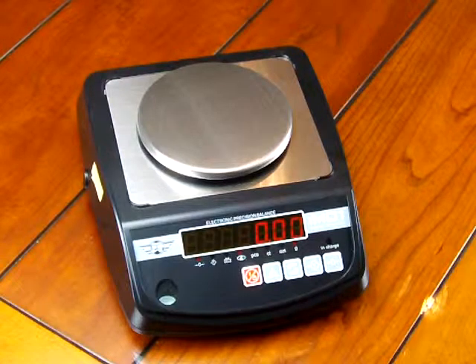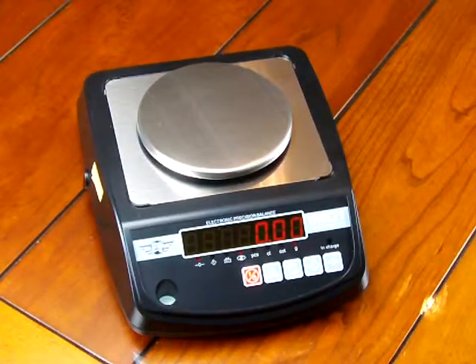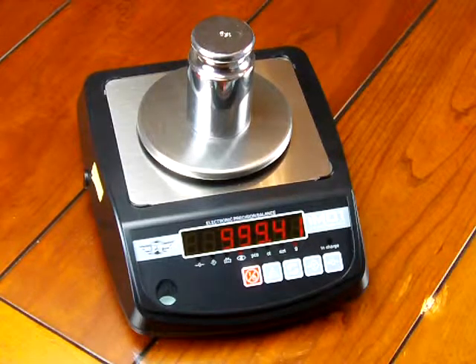I have the scale powered up. You'll notice it has an LED display which is nice and easy to see. There is one on the rear of the scale and I'll turn it around and show you afterwards. The scale when delivered does not come with any calibration weights — those are all optional. So if I put on a calibration weight, here's a thousand grams, you'll see the scale is off.